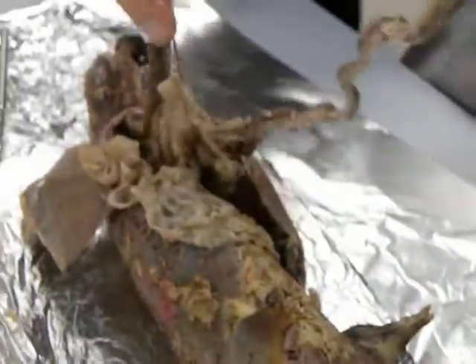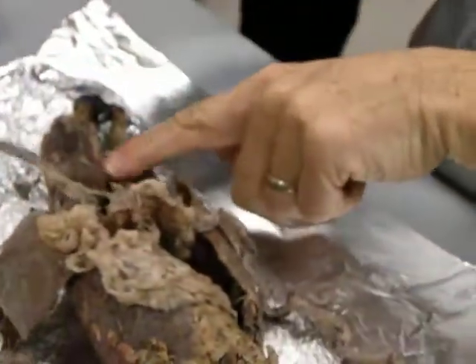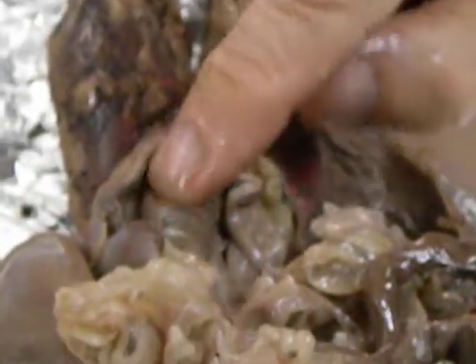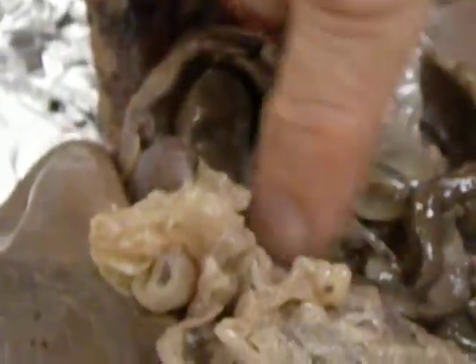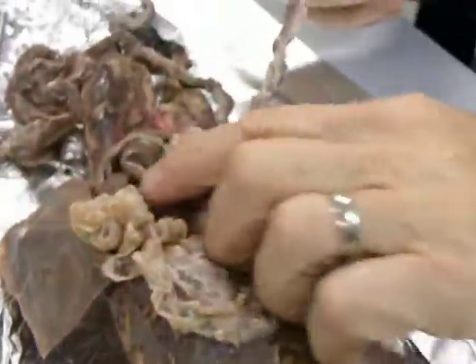You got to get the intestine so that you can see where it ends. And then the colon is here, this bigger, bulgier section is the colon. Yours may or may not be that way. More often than not, the colon doesn't bulge, so that you don't get a good sense of where the colon is. The tube seems to be continuous. Now, going the other way, this is a good deal. If you got your mink and you want to carry it, you can use this as a lanyard. It works pretty well. Or it's like a guitar string carrier.